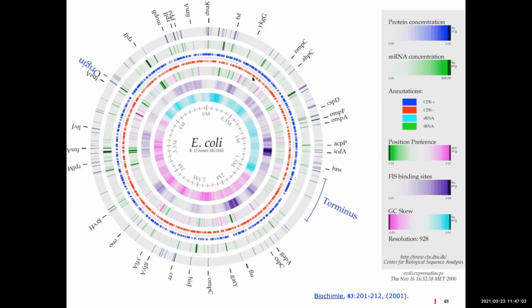So if you look over here, can you see my mouse? Yes. This green is lots of RNA, but there's no protein. What do you think is going on? It's probably not protein coding. It turns out this is, but you're right. It could be ribosomal RNA, and then that would make sense. But this actually does code for a gene, and this down here is also.